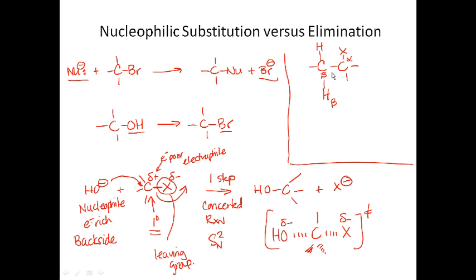And so the other possible reaction of an alkyl halide is that at higher temperatures, and I'm just going to deal with what we are looking at in this experiment, when we're doing a 45-minute reflux on our alcohol, what could happen is that we have a carbon that's attached to the leaving group.